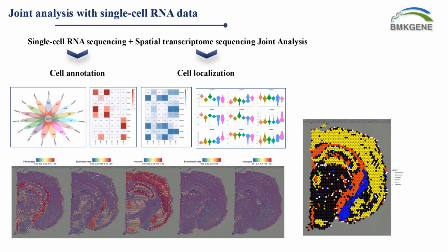So there are many studies coming up today that combine single cell mRNA sequencing with spatial transcriptome sequencing, to first have the single cell resolution information in terms of cell type annotation, and at the same time keep the spatial context. The most common way to do it is to make a correlation analysis between the cell information and the spot information, to give a better annotation of, okay, these spots are more likely to be one of the cell types. And this is a very simple example here.